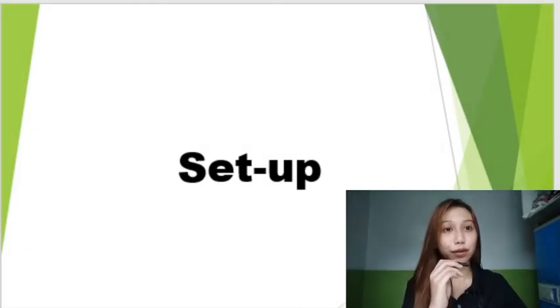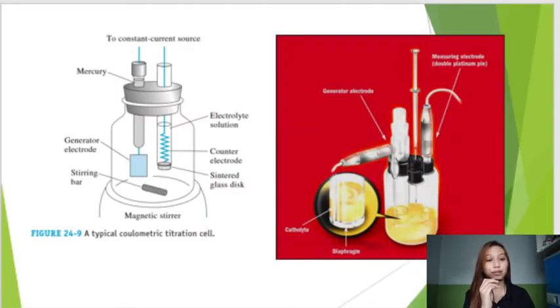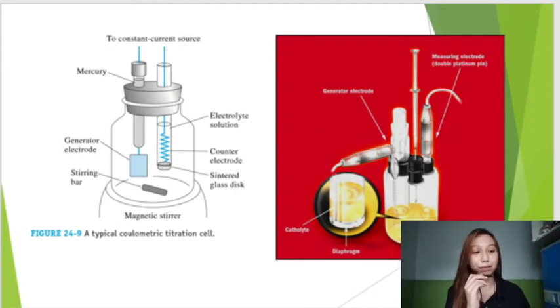This is the setup of coulometric titration. In the coulometric method, the titration cell consists of two parts, an anodic and a cathodic compartment. These figures show both compartments separated by a ceramic diaphragm. The anodic compartment contains the analyzed solution, which includes sulfur dioxide, iodide, and imidazole needed in the chemical reaction. Methanol or ethanol is usually used as a solvent. The coulometric method measures water levels much lower than the volumetric method.